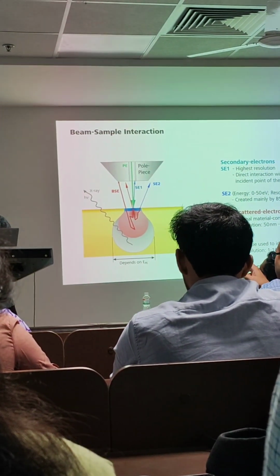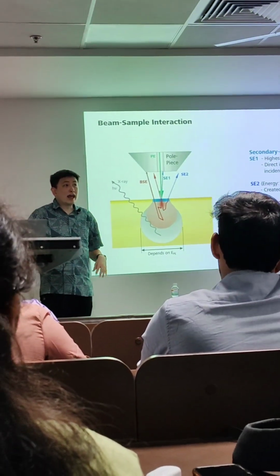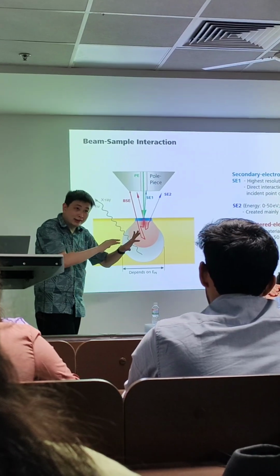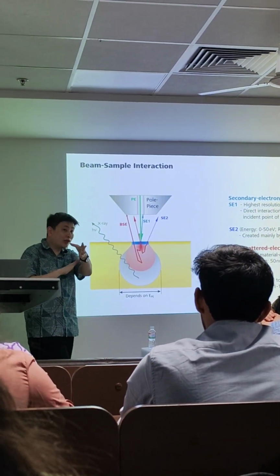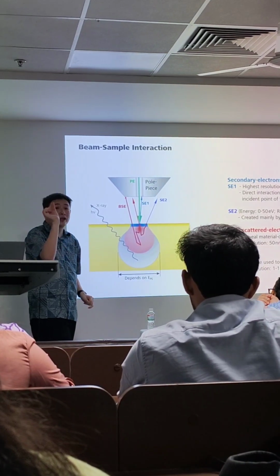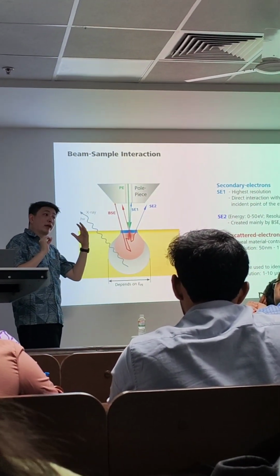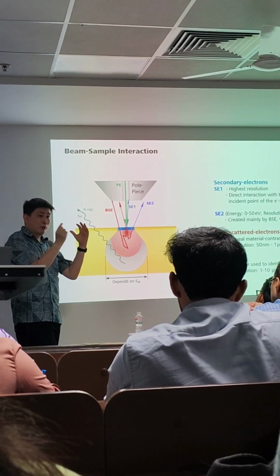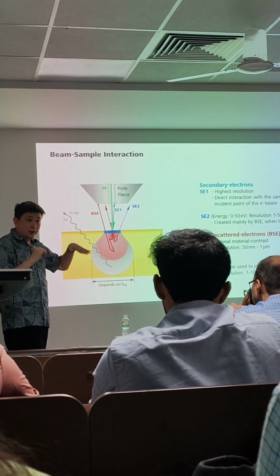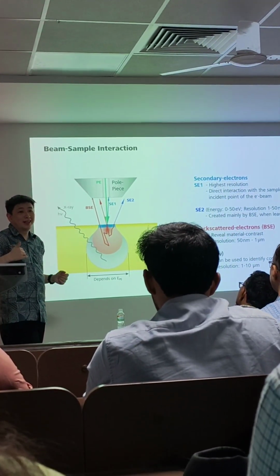So you have one detector only which will act both as BSE detector as well as kind of through the lens detector? We have different kinds of detectors. There are some only SE detectors, some are BSE, and this ESB is called energy selective backscatter detectors. We can control the repel voltage. So if we want more topographical, we can make it 0, right? So all electron coming. But if you want to repel all the things, we can just set it high, then only backscatter will be, right?